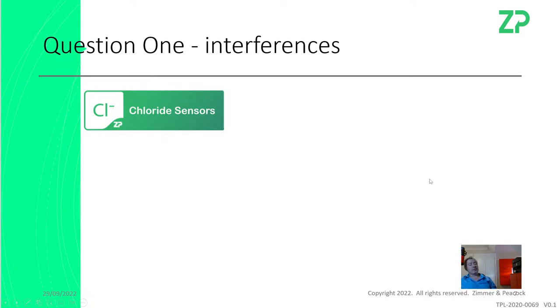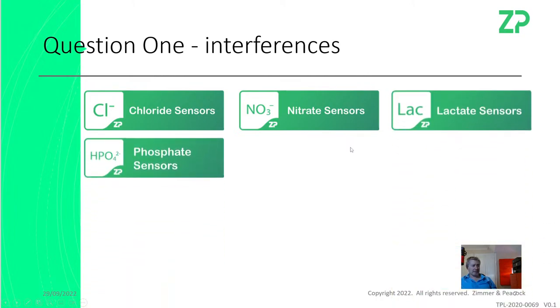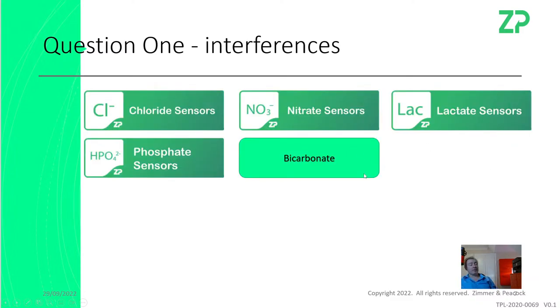Now, I've listed out some of the interferences here. So is a chloride sensor confused by nitrate? Is it confused by lactate? Is it confused by phosphate, bicarbonate? Whoops-a-daisy. And there was also sulfate there, and I'm sorry I missed the sulfate. The quick answer is we have not tested that sensor against nitrate, lactate, phosphate, bicarbonate, or sulfate.